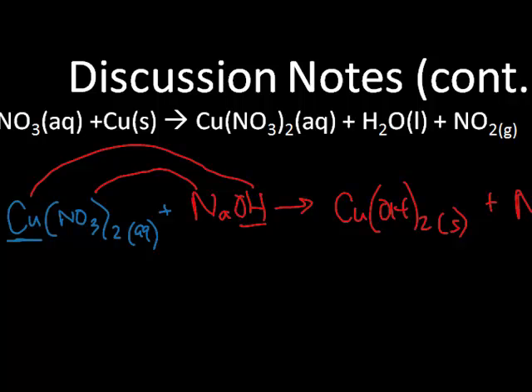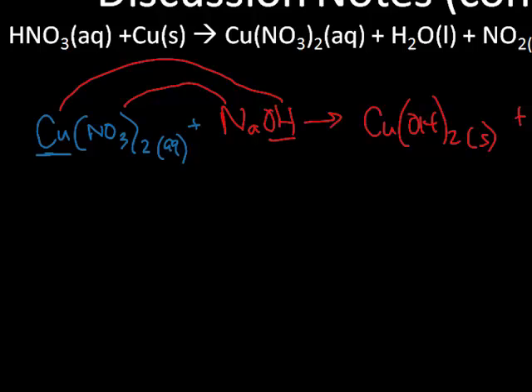The reason we know this is copper hydroxide is because it forms a blue solid, kind of gloopy stuff, more like a lava lamp. The sodium hydroxide is clear and colorless, so that's the solution we see. The copper nitrate solution was blue, it goes to a blue gloopy stuff with a clear colorless solution, and sodium and nitrate are the one thing that's left over, so we put them in the second aqueous solution.